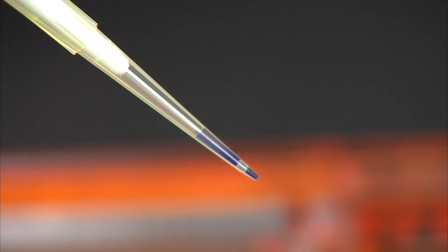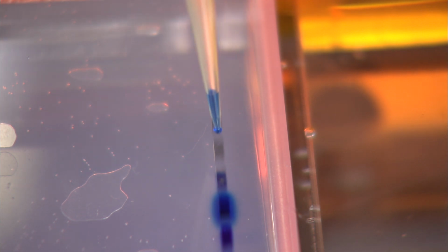A few other things to watch for when loading the gel are air bubbles in the pipette tip, dispensing the sample properly, but then releasing the pipette plunger and sucking the sample back up, or starting to dispense the sample before the tip is safely in the well.